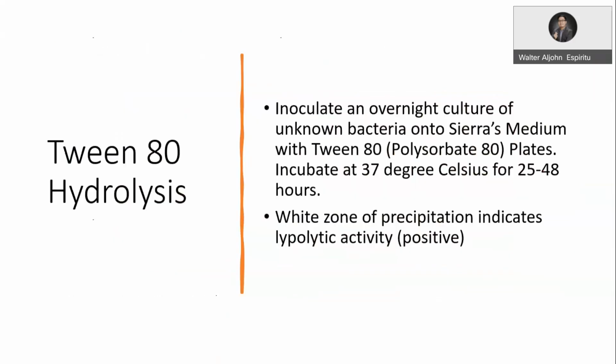The next is for the utilization of lipids. Here we use the Tween 80 plate.